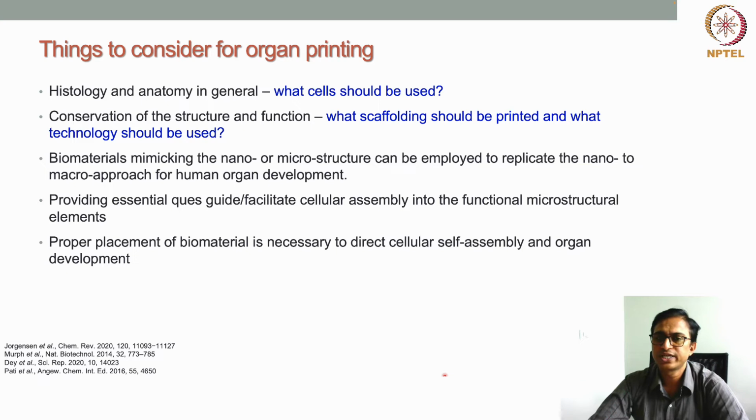Different scaffolding techniques exist. With bioprinting, we can print different types of structures that are helpful for developing a particular tissue or organ. So for the structure you need to print, what technology should be used?